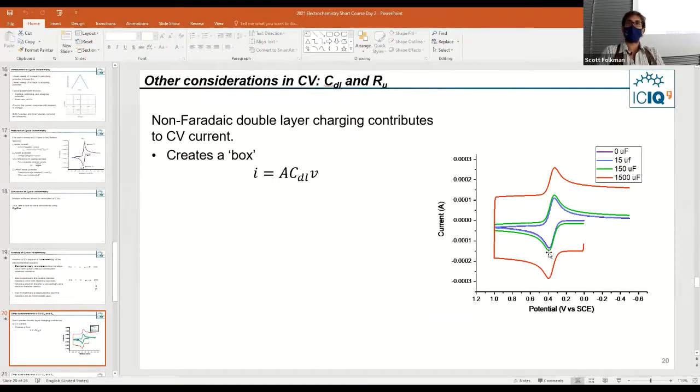So then if this one is more sensitive, why do people usually use CV? So the question is, if differential pulse voltammetry is more sensitive, why do people use CV? I think it's probably for ease of use, because it's easier to understand. I think at least as a first glance, for most experiments, it's typically sufficient. So if proton NMR is good enough, do I need to do HSQC? It's just a little bit simpler, more common.